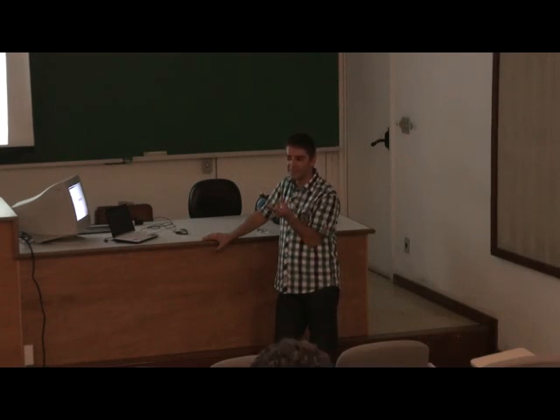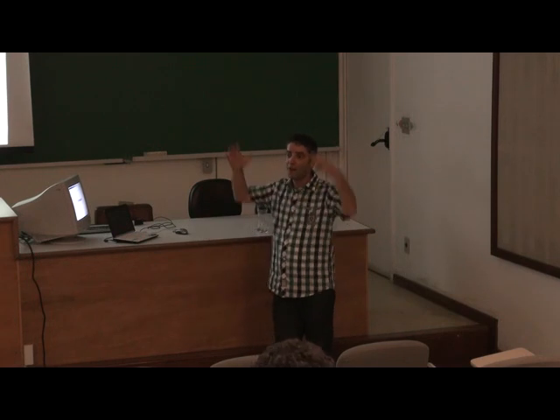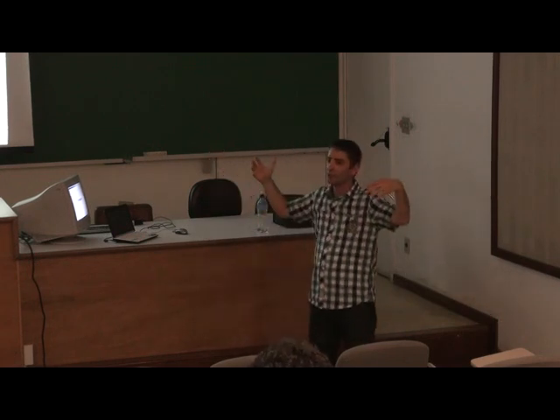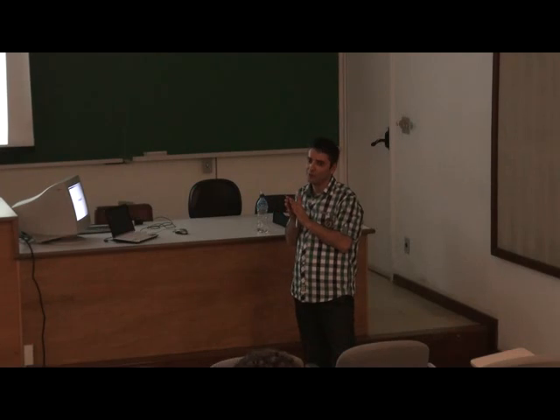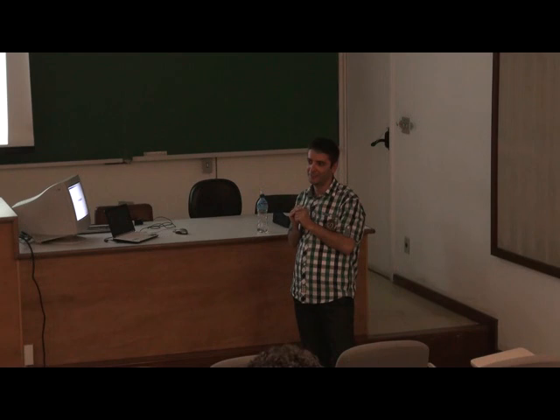But as I said before, the results are at the macroscopic level. So we should apply the experiments at the microscopic level. So we applied the SAXS measurements. SAXS measurements gave very, very wonderful results.